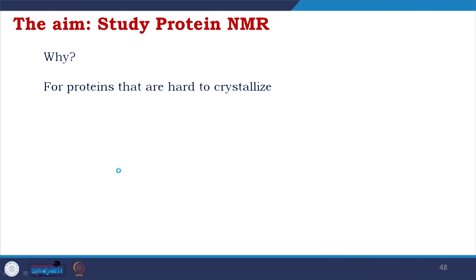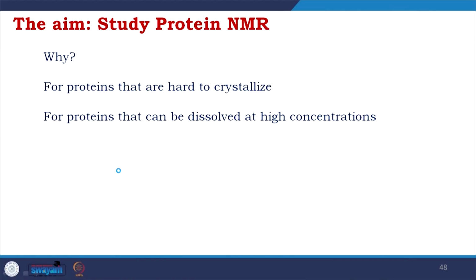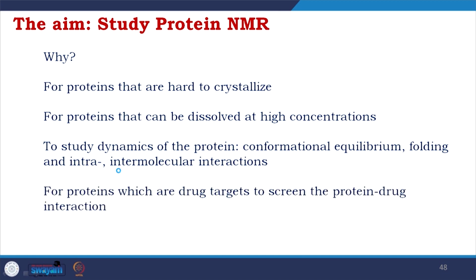So, why do we study protein NMR, why is it important? In the initial days people used to think that we are studying NMR for proteins that are hard to crystallize, which was definitely true, which is true today also, but what has changed, we have found many other applications of NMR structure for proteins that can be dissolved at high concentration, to study dynamics of protein, conformational equilibrium, folding and intermolecular interactions, for proteins which are drug targets, to screen a protein drug interaction, for DNA drug interaction.